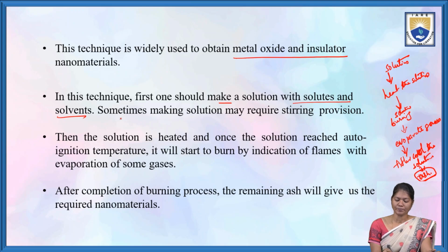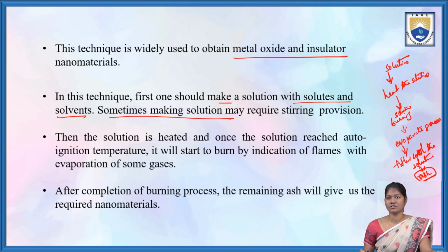Sometimes making this solution may require a stirring provision. That is, we have to stir with a magnetic stirrer or magnetic pellet. By using the magnetic pellet, we mix up this solution.